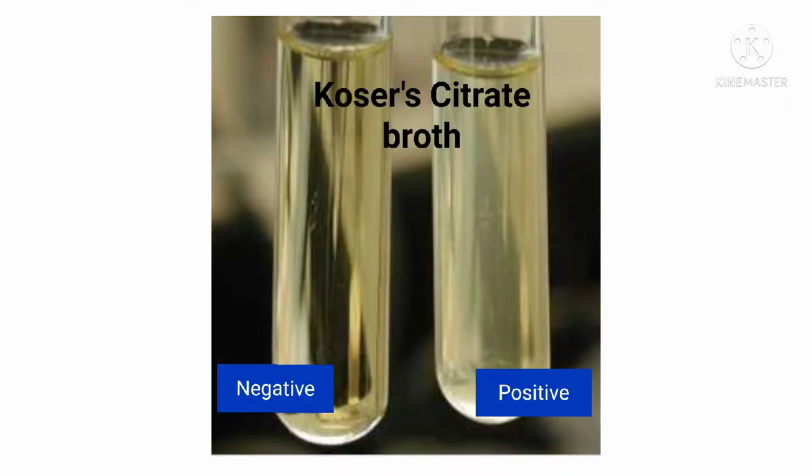Some citrate containing media are Koser's media. It is a liquid media with sodium citrate and ammonium dihydrogen phosphate as the main ingredients. They also have sodium chloride, magnesium sulfate and potassium dihydrogen phosphate buffer in distilled water. Here the citrate utilizing organisms will survive and the media will become turbid.